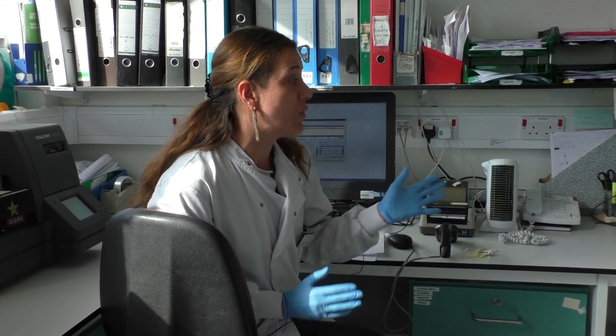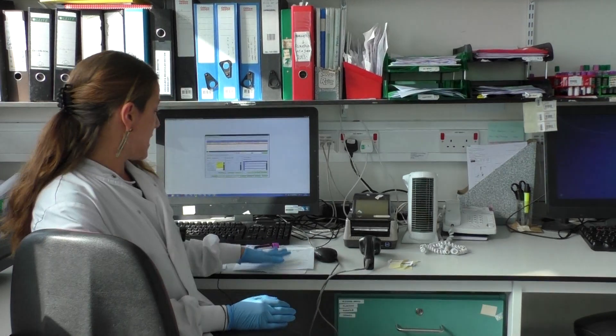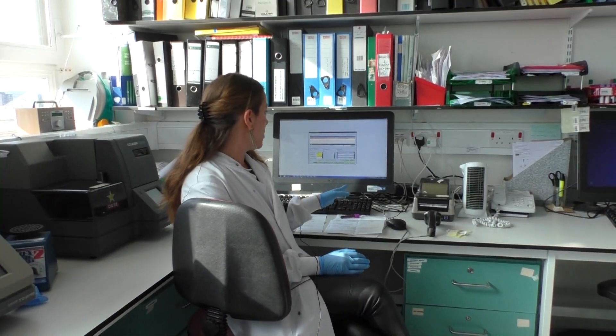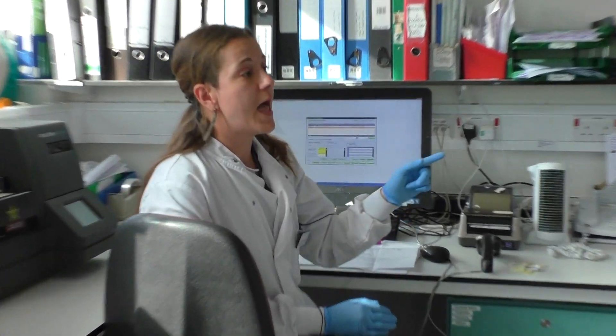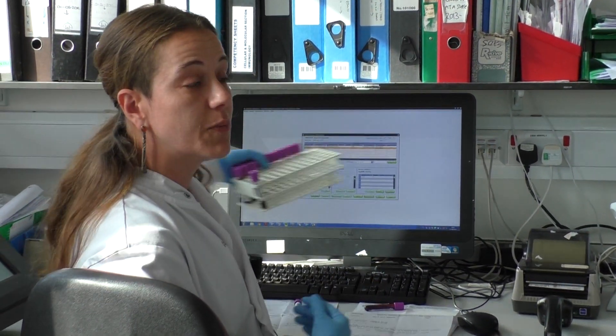We'll be looking for either just lymphocytes or the full lymphocyte subset. We divide them straight away. I'm here booking them in - we put them on our system and then take them to the machines to lyse ourselves.